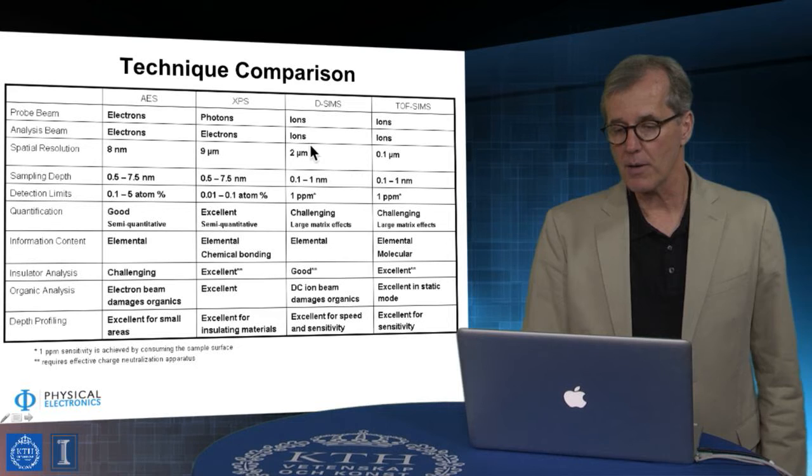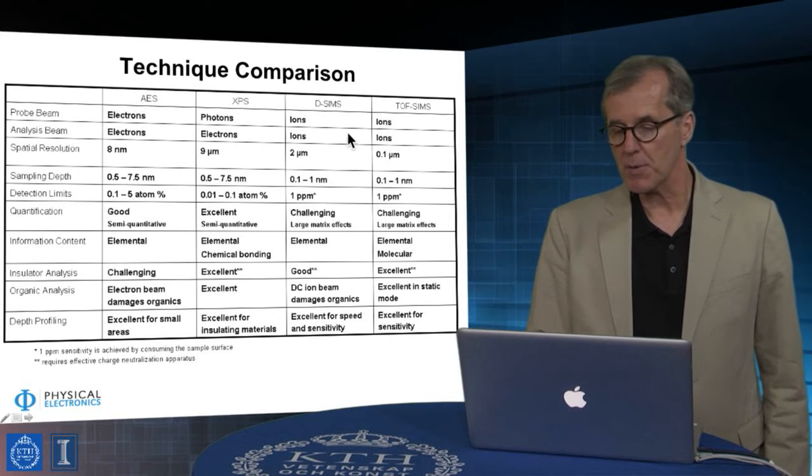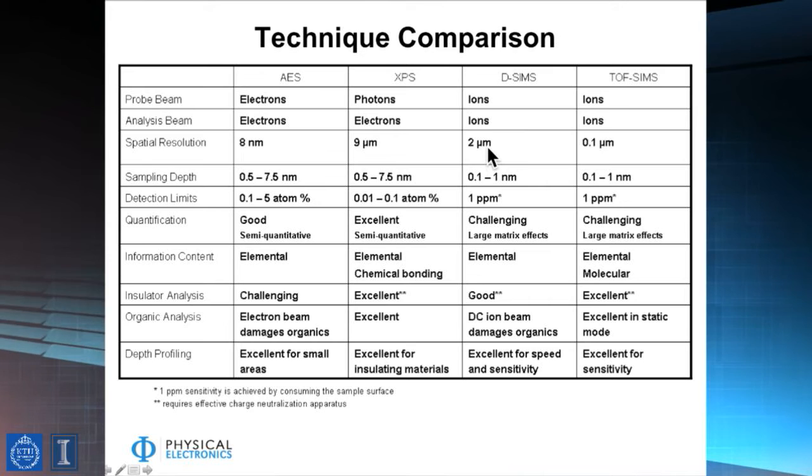But now here's the part about SIMS instruments. Typically, dynamic SIMS is not a small spot because it's more to analyze matter in depth. But static SIMS can actually be very high spatial resolution measurements. And here it says 10th micron, but actually very state-of-the-art instruments can push this by more than a factor of 10 higher. Now here's where things are very much different in terms of detection limits.